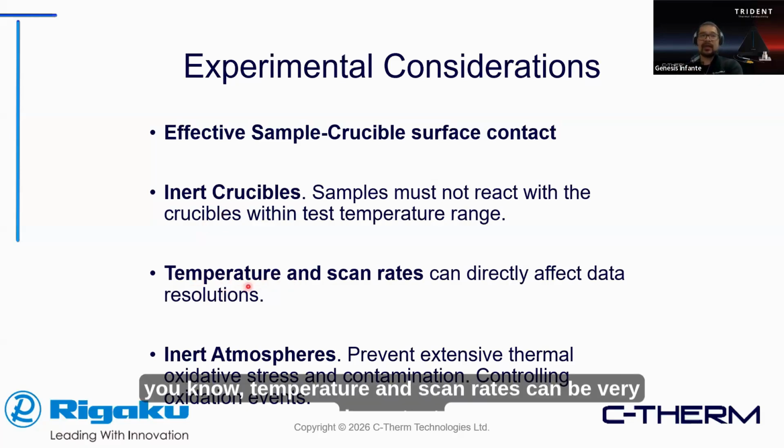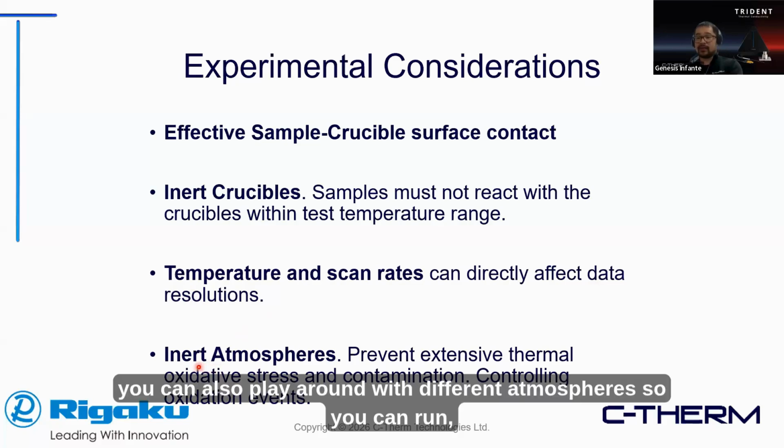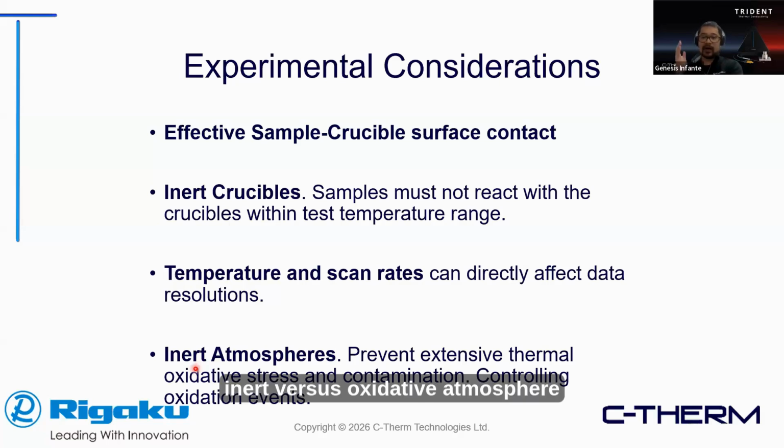And also, temperature and scan rates can be very important, depending on the resolution and whatnot. You can also play around with different atmospheres. So you can run inert versus oxidative atmosphere to see whether your reaction would have some effects on your thermal events.